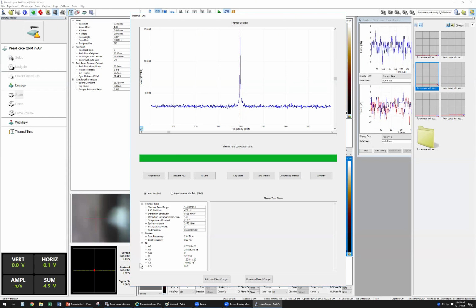The word is too small. Okay, you can write down here. Okay, this key L is 160 micro. W is 40 micro, right? Okay, you need these four parameters.